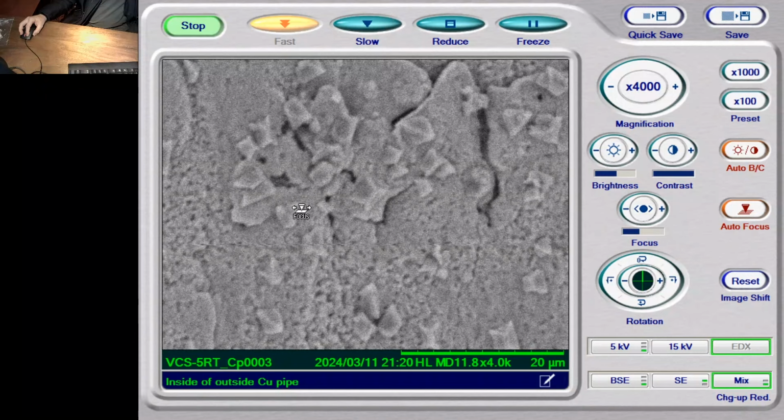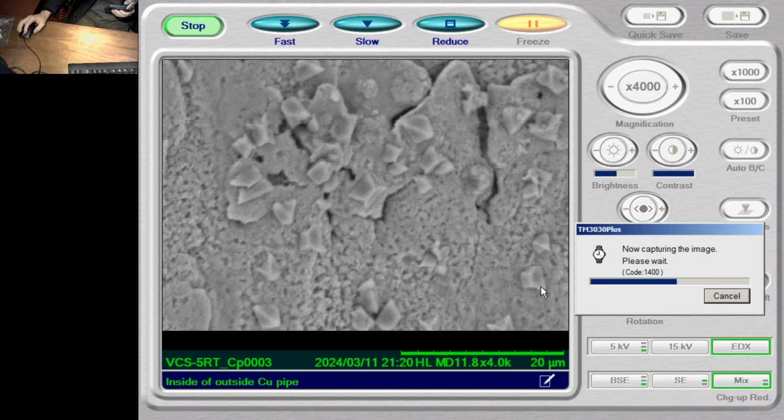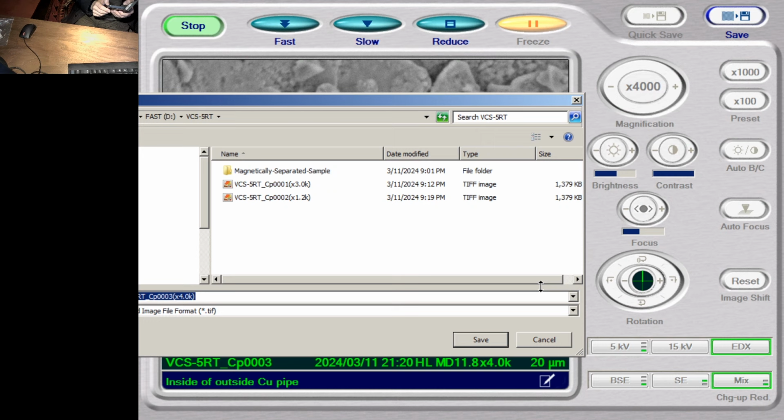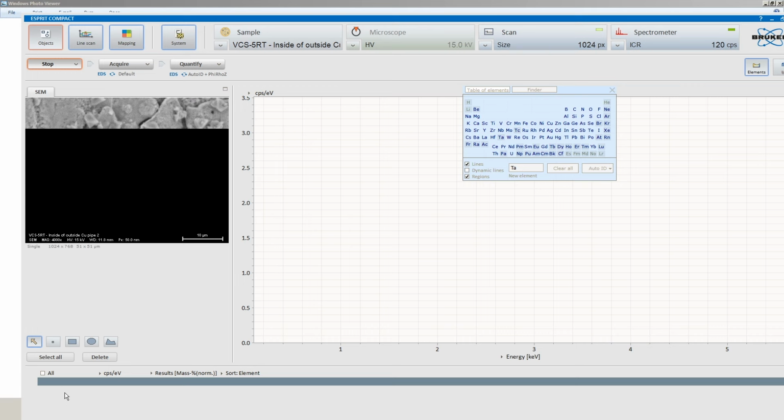So when you see this, it's to do with the charging on the crystal, and if these are copper 1 oxide, cuprous oxide, that is what we are looking at here. Normally this is kind of like red in colour. I imagine this is going to be pretty much the same. We'll actually have a look at this crystal here. That's what it is.